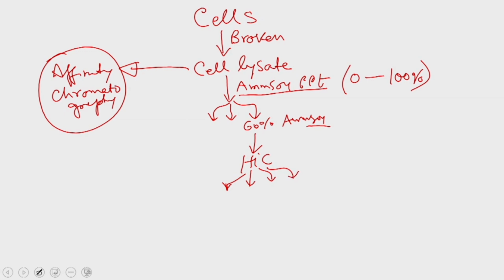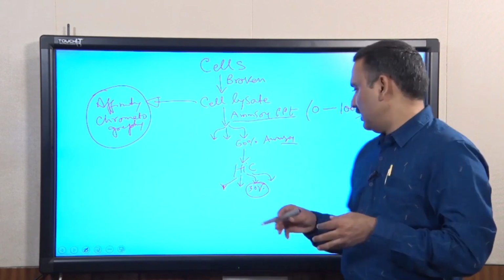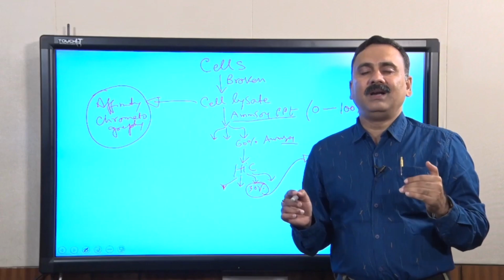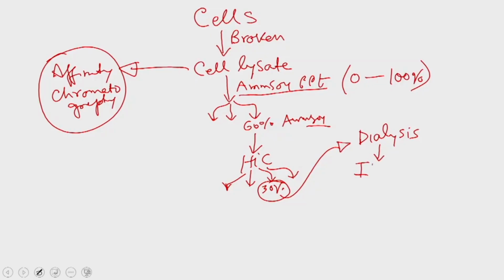Now, imagine that I got a fraction where 30% ammonium sulphate gives me the fraction which contains my factor. Then I will take this factor and do a dialysis step, and that is going to reduce the level of salt present in this particular fraction. After that I will do ion exchange chromatography, followed by gel filtration, and that is going to give me the purified protein.